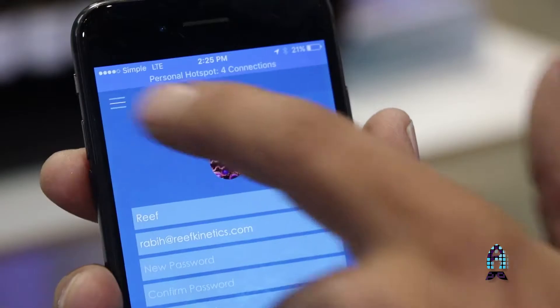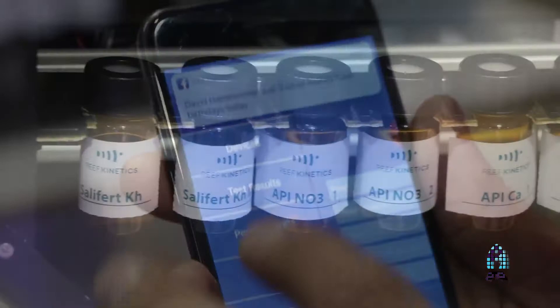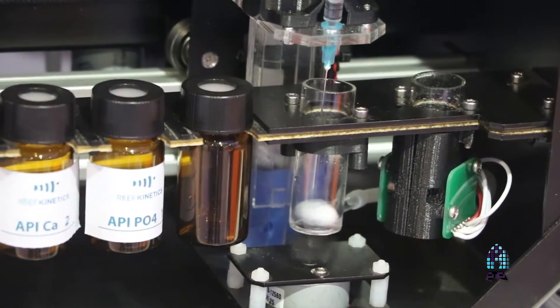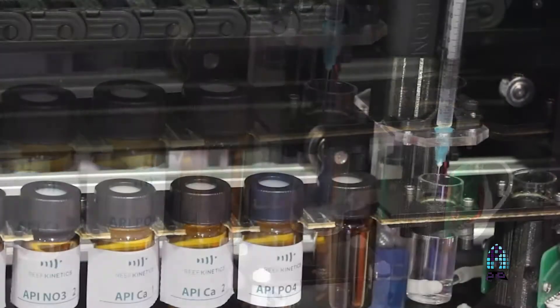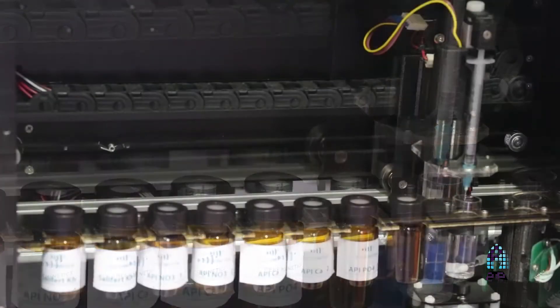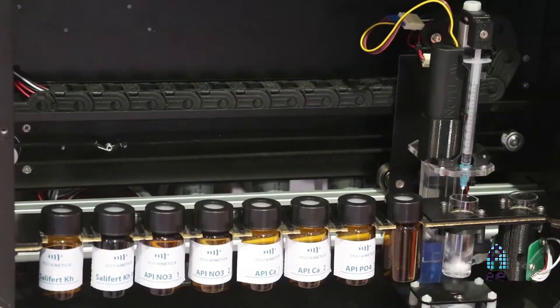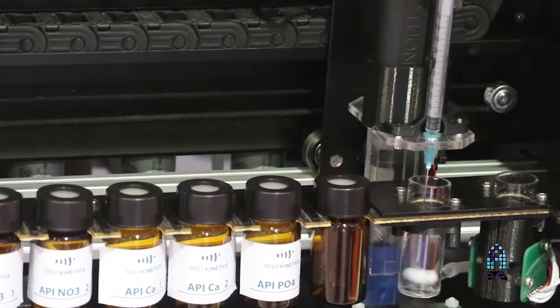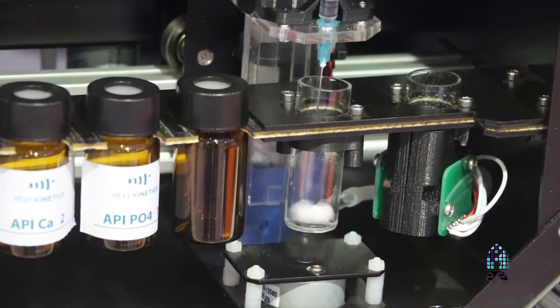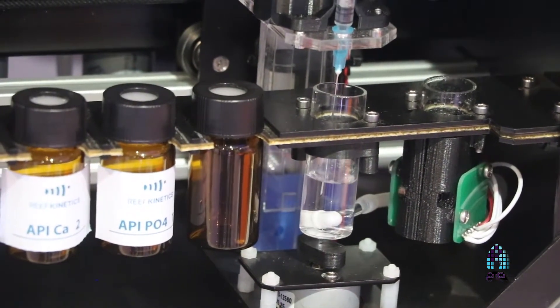Everything is controlled through an app remotely. You have here the reagent that you use usually with a magnetic stirrer. You just put it in the device and there's a syringe that will move throughout all the reagent, pick up the reagent, put it in the reaction chamber. It will draw automatically the water from your tank into this chamber, flush it, and then make the test for you. The syringe and the needle will be washed and cleaned with RODI water between each reagent for no cross-contamination.